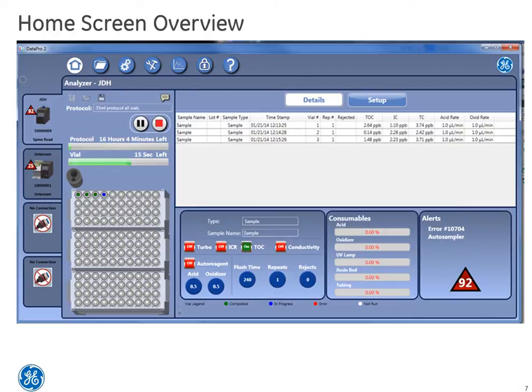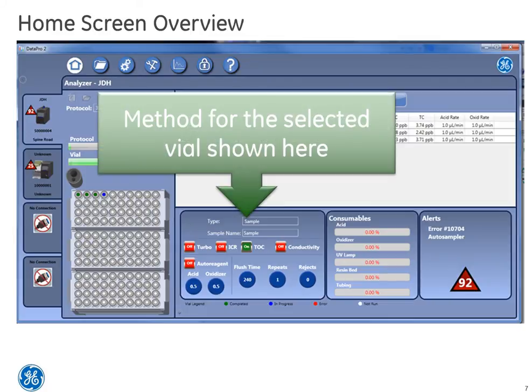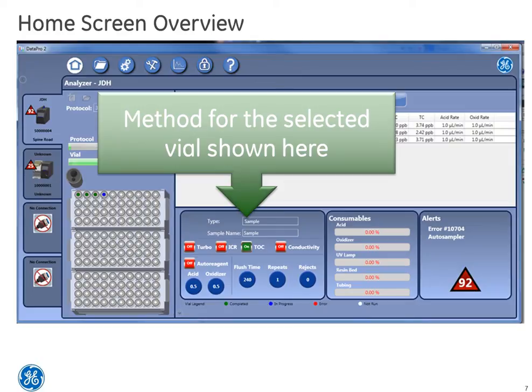Below the results display is the method display. This display helps provide critical information on the method that is running for the unique vial being analyzed. We will go into a lot more detail about this critical display a little bit later.